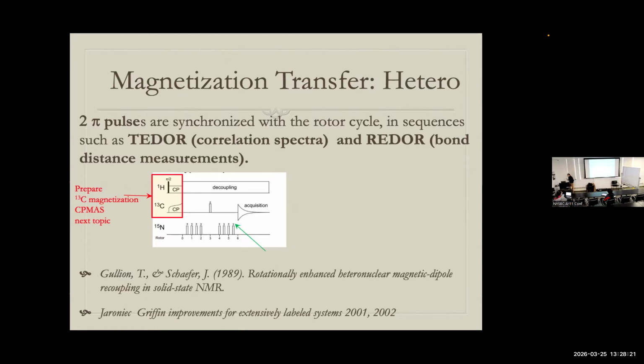But I mentioned this pulse sequence not because it's the thing we're going to do today, but because I think it's the most intuitive of them. If you just hit it with 2 pi pulses per rotor period, you could flip over every time it's trying to change sign on you. You can change sign back so that it restores the sign.